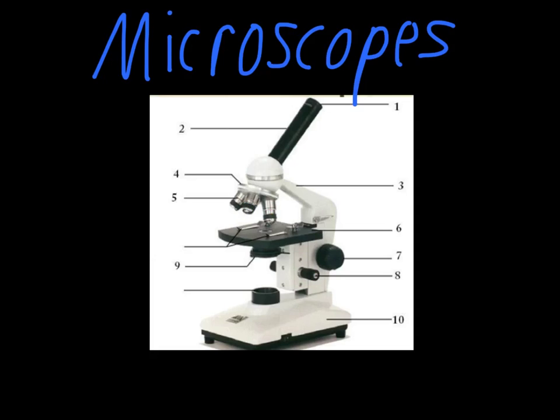Another important thing about the stage is that there is a hole in it down here at the bottom covered by glass. That allows a certain amount of light through from your light source down here at the bottom. The thing that regulates that is this piece underneath. It's called the diaphragm. Now, with our microscopes in class, this looks like a disc that you can select different size holes in.